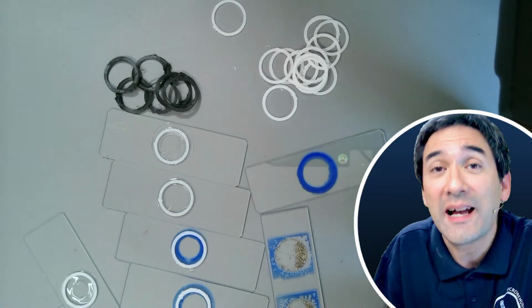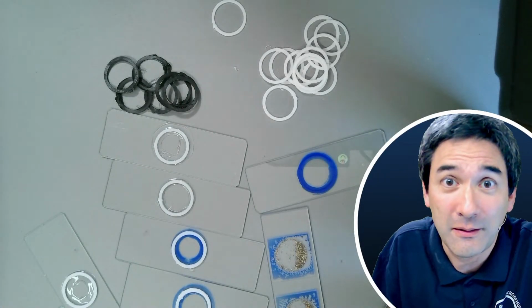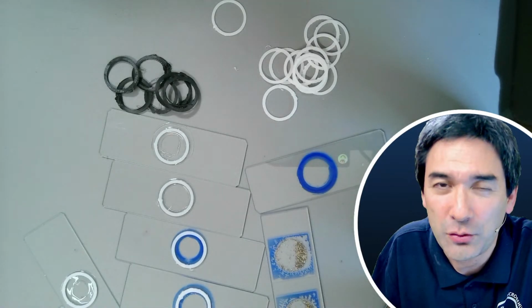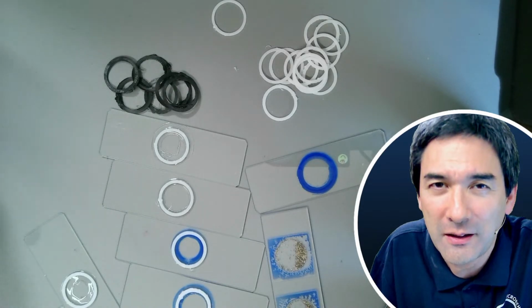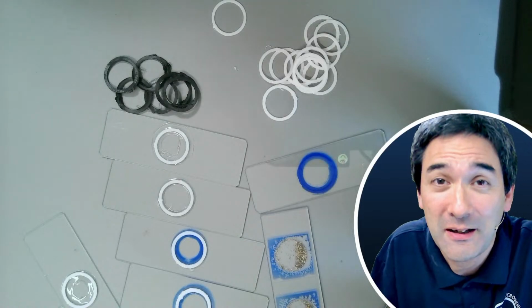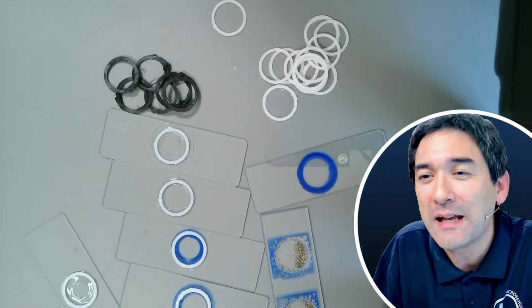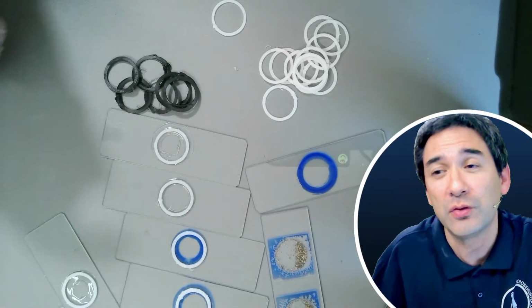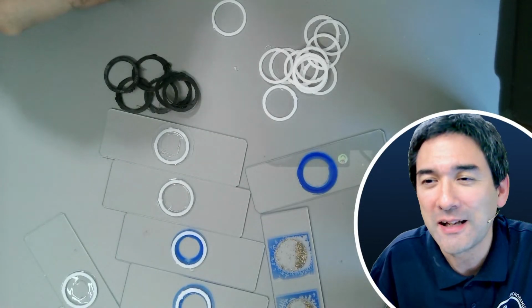Where did you get the sand from? I will talk about that. Some of my students brought them along from holiday trips, but I do want to say a little warning here. You got to check the legality, because it's not allowed to take along sand samples from every country, so be careful here a little bit. But in any case, I've never looked at those sand samples under the microscope yet, and this is actually one of the reasons why I would like to prepare those slides.